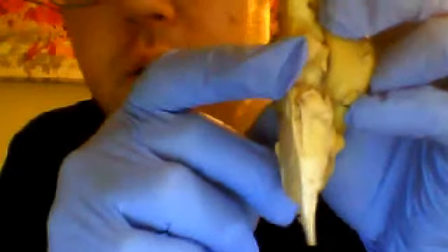Next we'll move on to the cerebral peduncle. For the cerebral peduncle, you want to look at it from here, this area, let me get it into focus, right there, and you can see it on the brain on the inferior view right there. Okay?